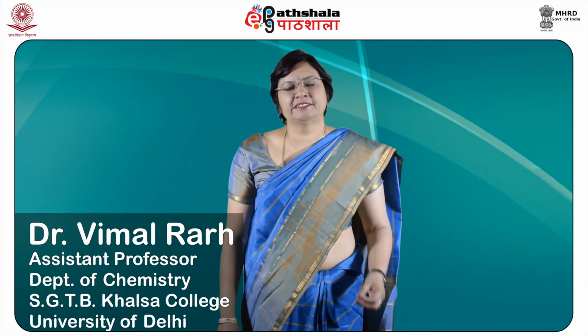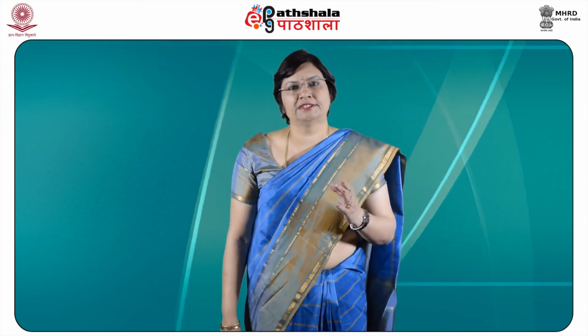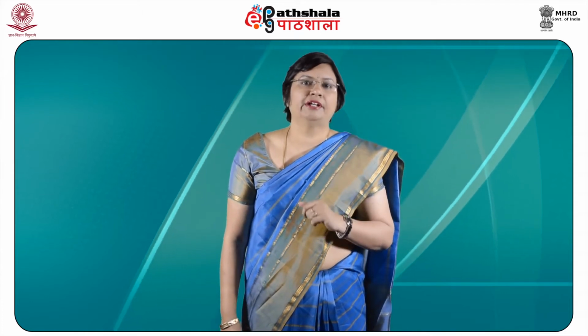Dear students, let us continue our study in this paper, which is organic spectroscopy, and in this particular module we shall understand the advanced NMR techniques. After studying this module, you shall be able to determine the multiplicities of all the carbon in a molecule using a combination of 13C NMR, DEPT and 2D NMR. You shall be able to know about the 2D NMR technique, and also you shall be able to compare between the 1D and 2D NMR.